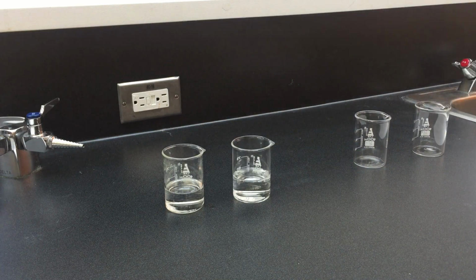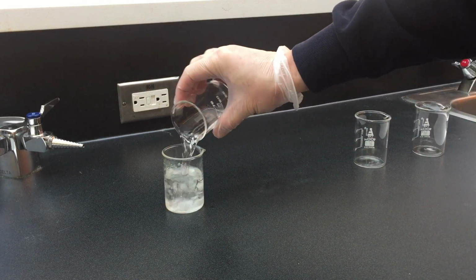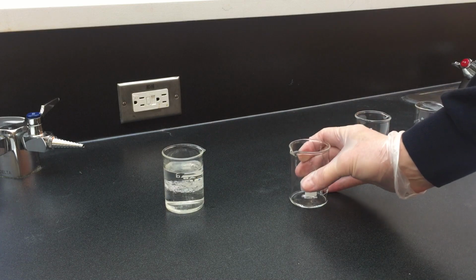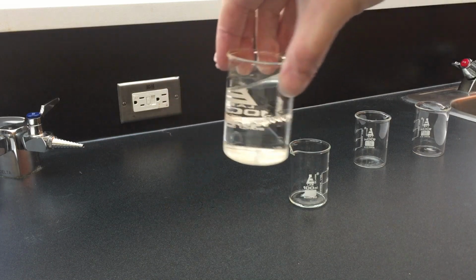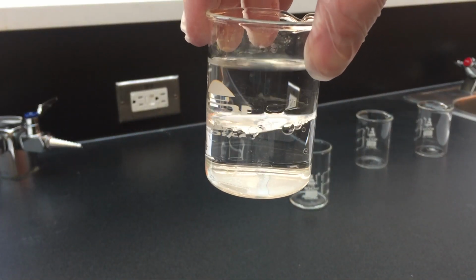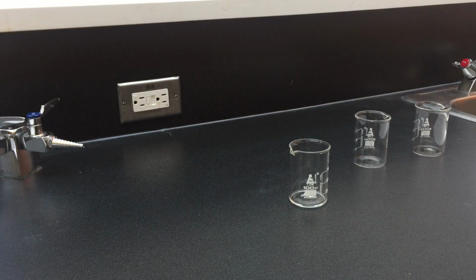Of course, an aqueous and an organic solvent do not mix. So when I pour water and cyclohexane together, it immediately forms layers. That's going to be important. We now have an interface, and that interface is where the reaction is going to take place between my two reagents.